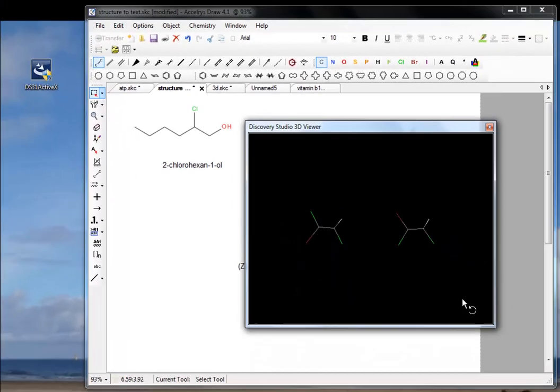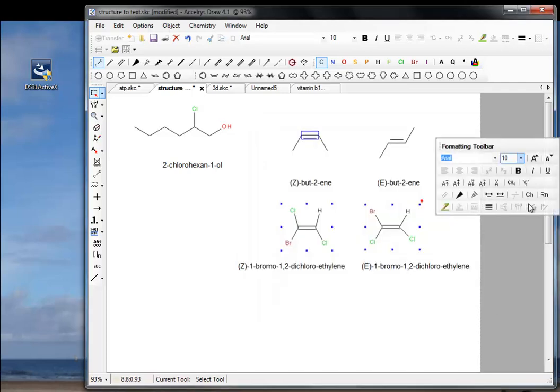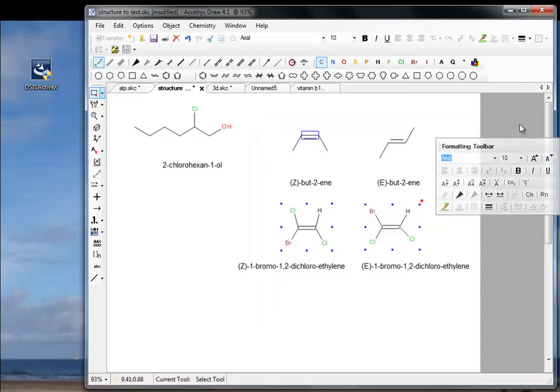I'm going to stop this video here now and we'll start up again in a minute, looking at another aspect of AccelerusDraw.